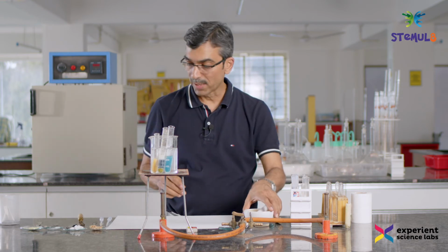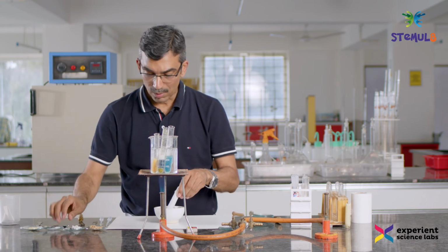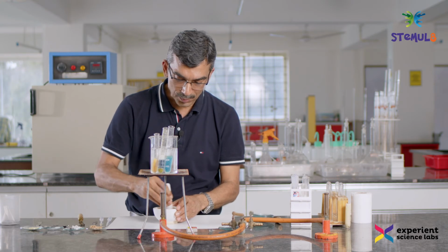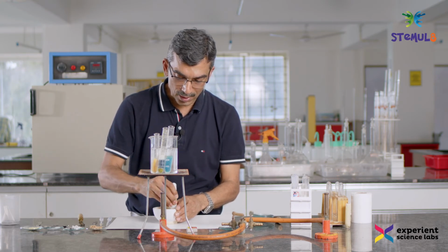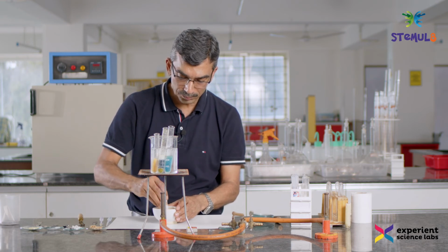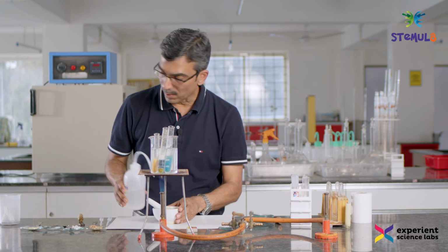I will have to once again prepare the paste of rice so that we give enough opportunity for the rice to interact with the DCPIP to show whether it has any vitamin C or not. A bit of water can help.